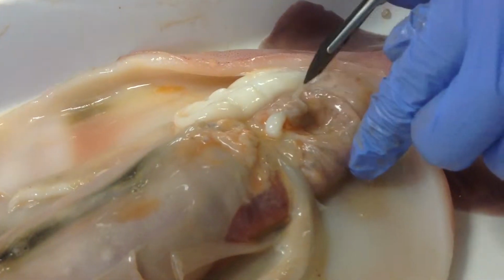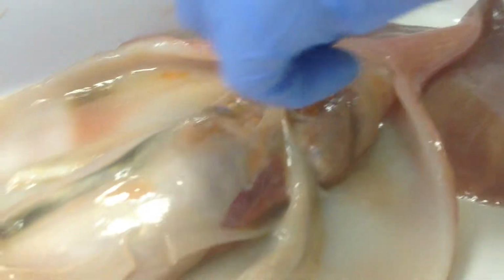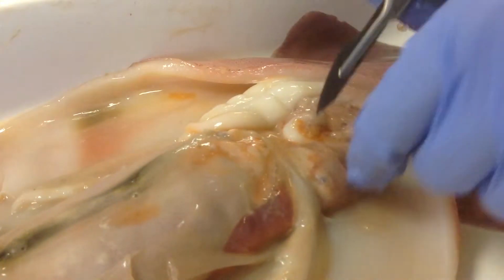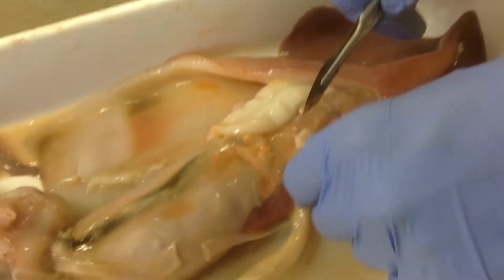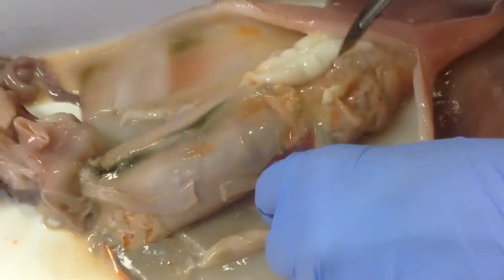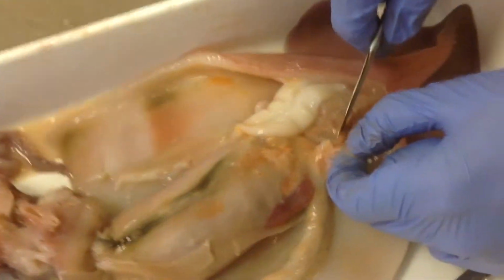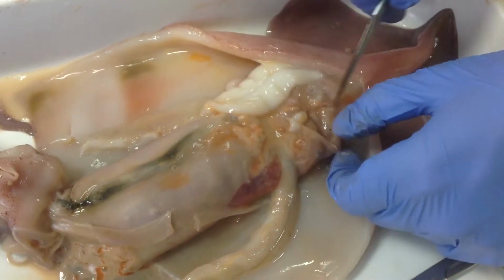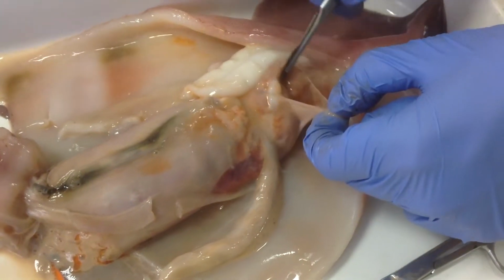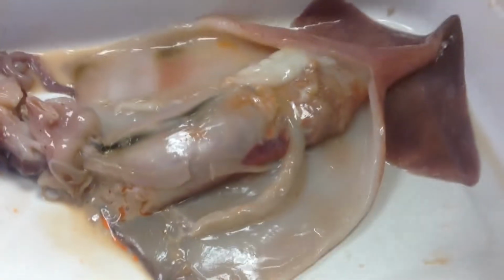So we're opening up the film. It's more of a liquid, so does it have a digestive tract at all? Maybe it just uses some sort of slow system. This is quite weird, because this is where the gills are leading to. This could just be a completely devastated lung that's just been rotted away. Perhaps it's a heart, and what we've been assuming is the digestive tract is actually blood. It's destroyed, though, so there's really no way to know.